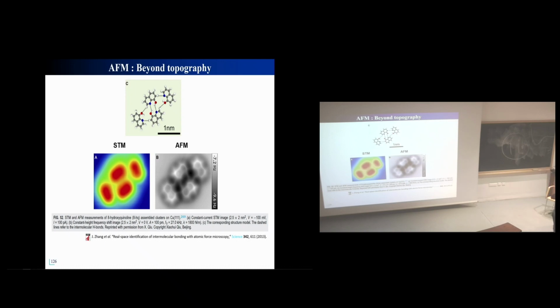But what is most impressive is that you can see the position of the atoms, and you can also measure some chemical bonds with an AFM. It's so cool. If you want to know how it's possible, I advise you this nice paper from the Pope of non-contact AFM. It's very well explained, no equations, just basic concepts, wonderful.